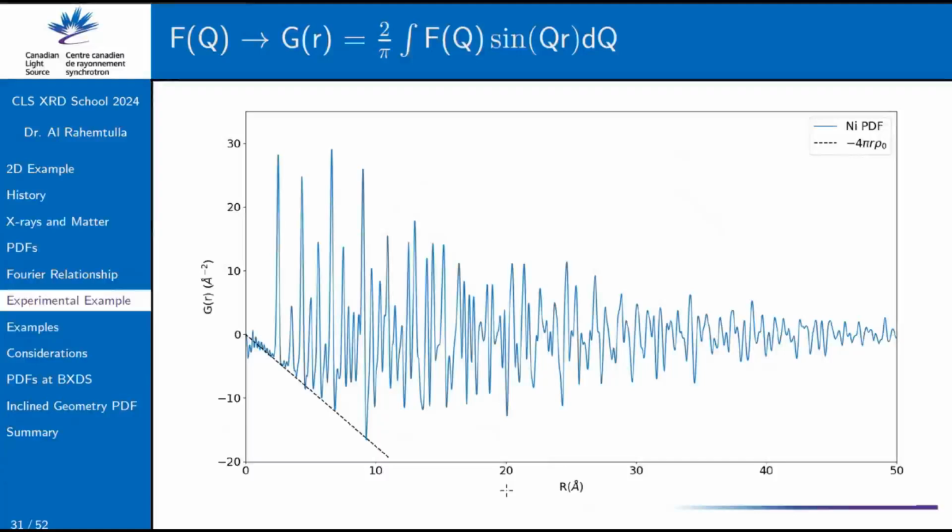But usually the stuff that exists before your stuff could look like a peak, but at that point you probably use just bond lengths to tell you whether or not it makes sense. And a lot of this stuff usually lives below 1 angstrom. So it's pretty apparent it's not real.